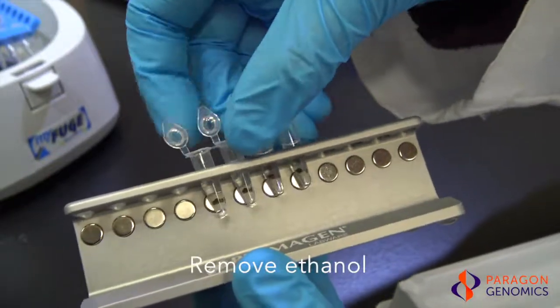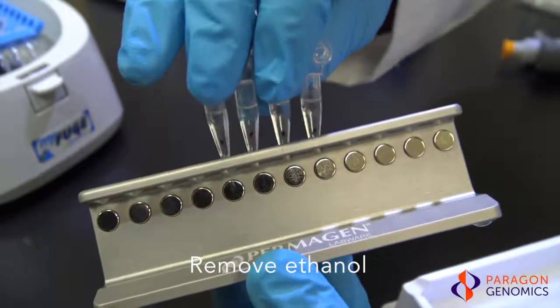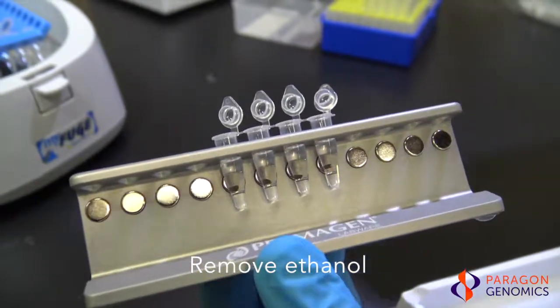Rotate the tubes 180 degrees on the magnetic rack to force the beads to move across the ethanol. The tubes can be returned to the original position afterwards for ease or left as is.